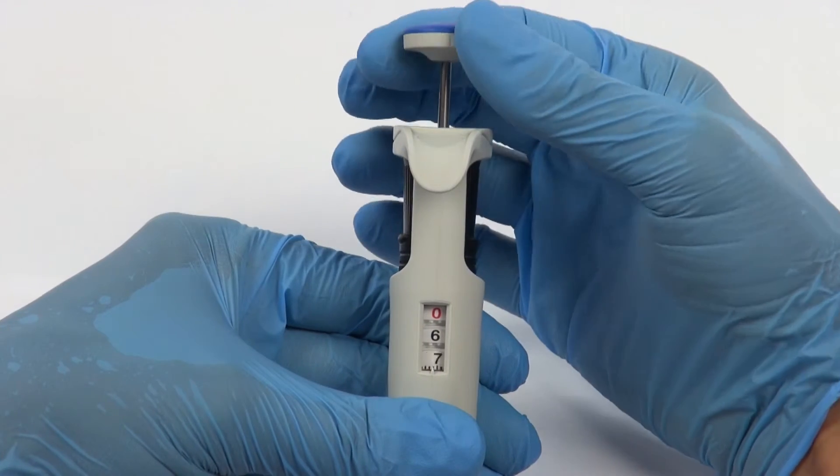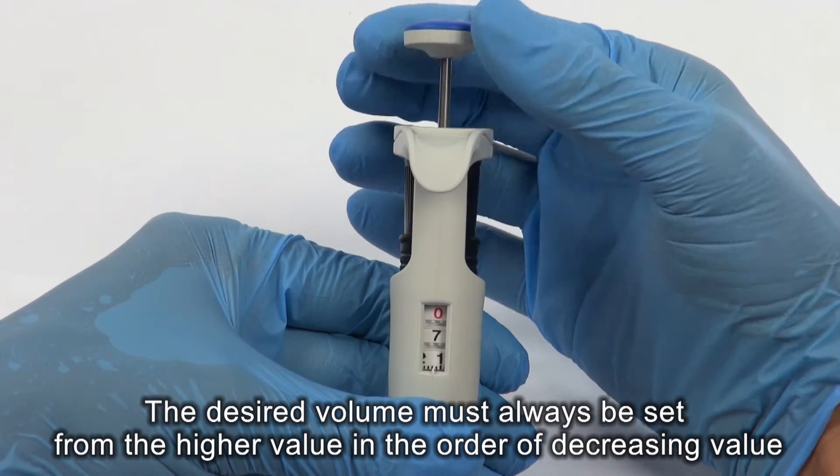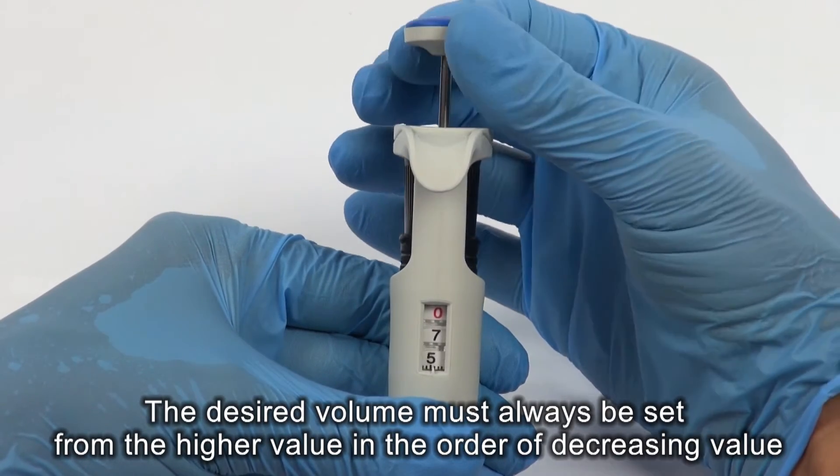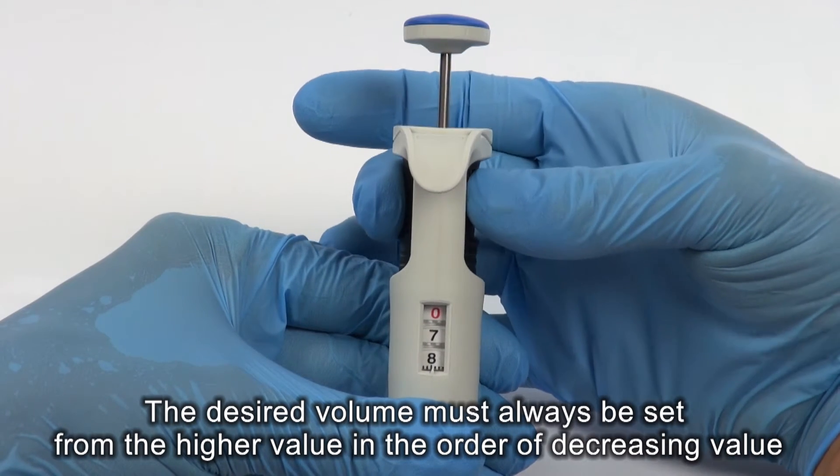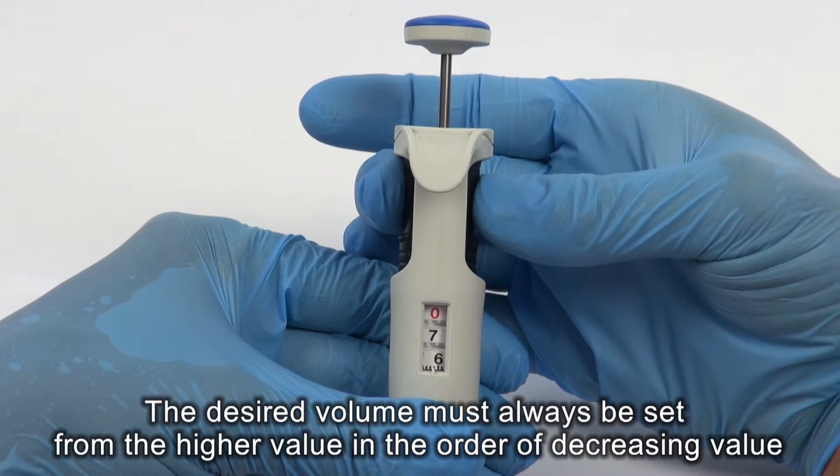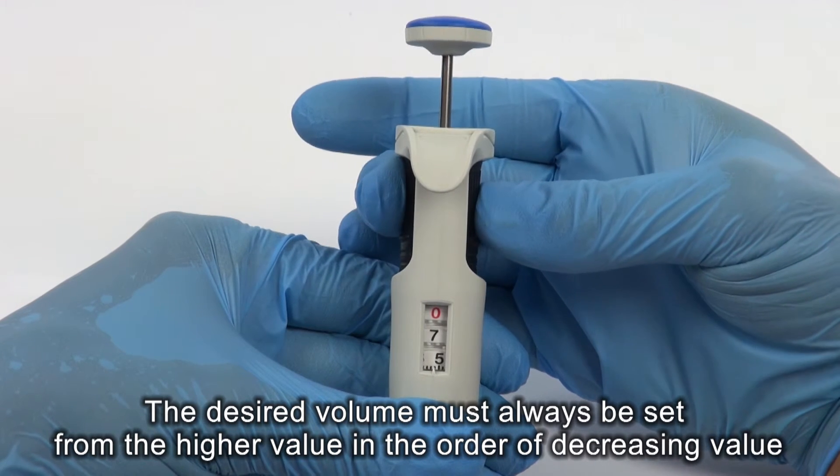If the desired volume is higher than the set volume, turn the pipetting push button, increasing the value until the lower figure wheel comes one third of a turn beyond the required setting, and then turn slowly backward.